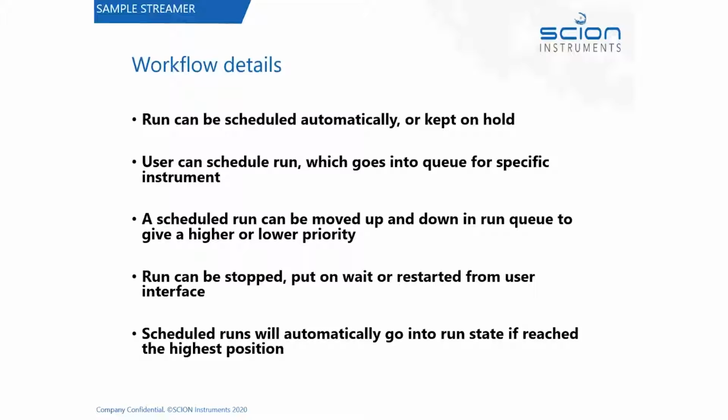Any runs that are scheduled, so those that are in the queue, you can decide, oh man, this one that's a bit further down, I need that to be run much more quickly. The customer is chasing me for the result. You can move it up the sample queue till it becomes the next sample. If you want, you can stop the current sample and force it to be faster, but generally speaking, moving it up to be the next sample is as much as you need to do.